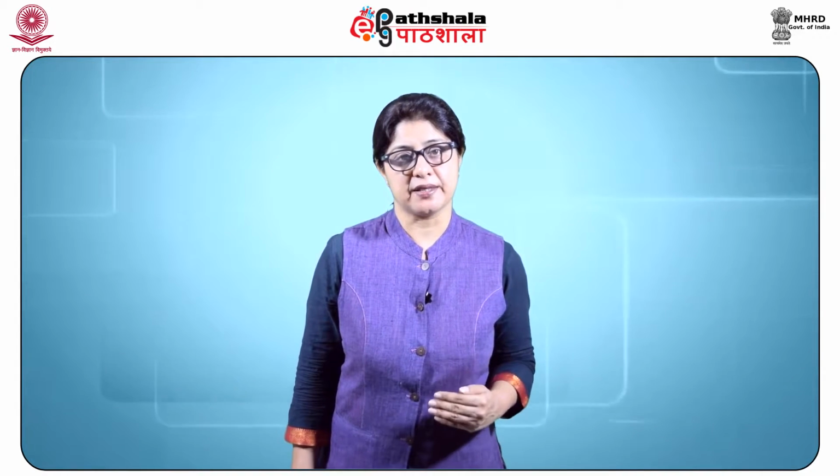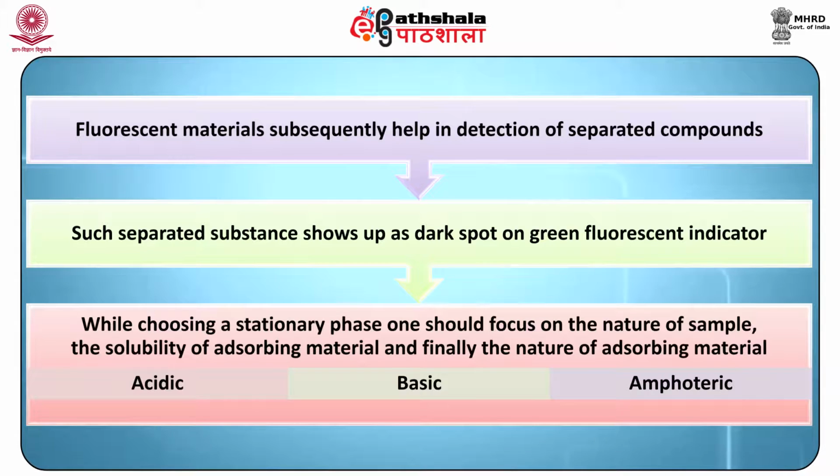In real practice, thin layer chromatography utilizes inert fluorescent ingredients such as zinc silicate in the coating materials, and addition of these substances does not change the chromatographic characteristics of an adsorbent. These fluorescent materials subsequently help in the detection of the separated compounds.